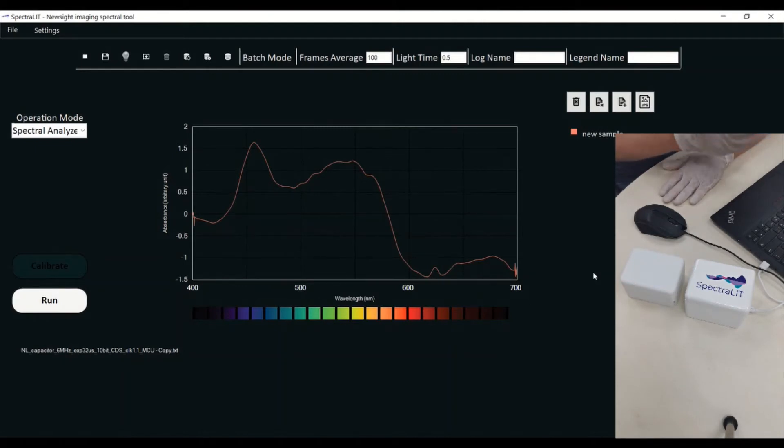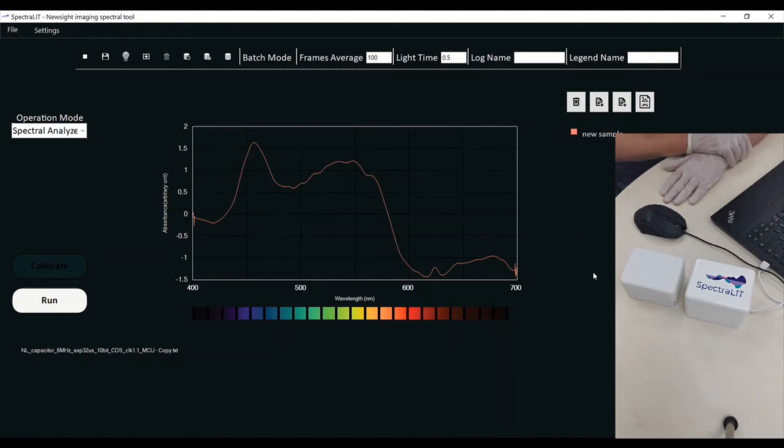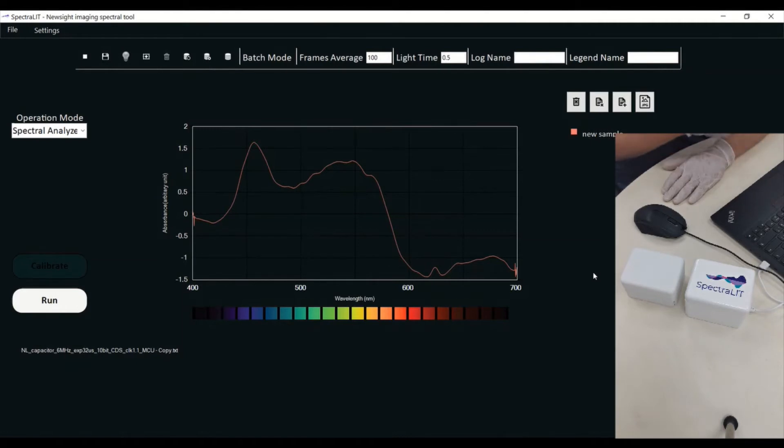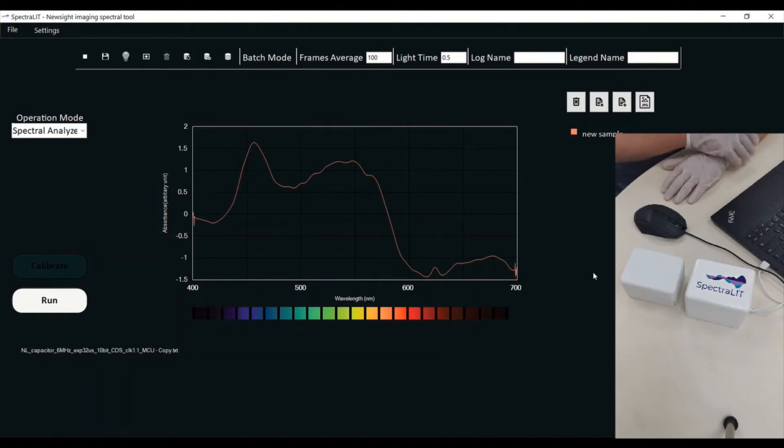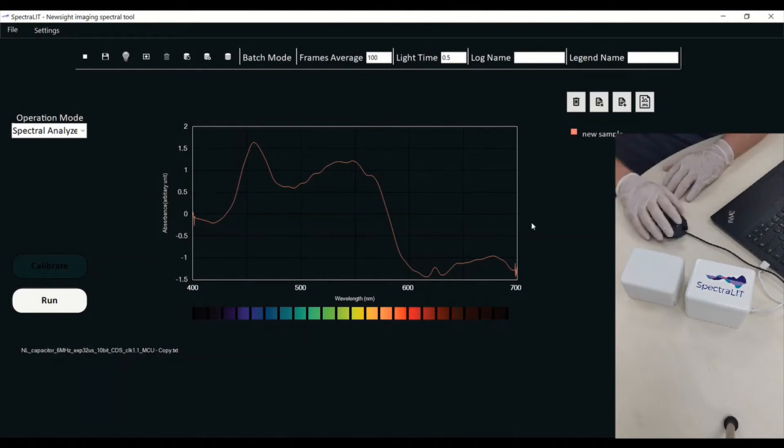I can also do a search, meaning that if I have substances uploaded into my database, I want to make a search inside the database and try to match what I have here to the substances in the database.